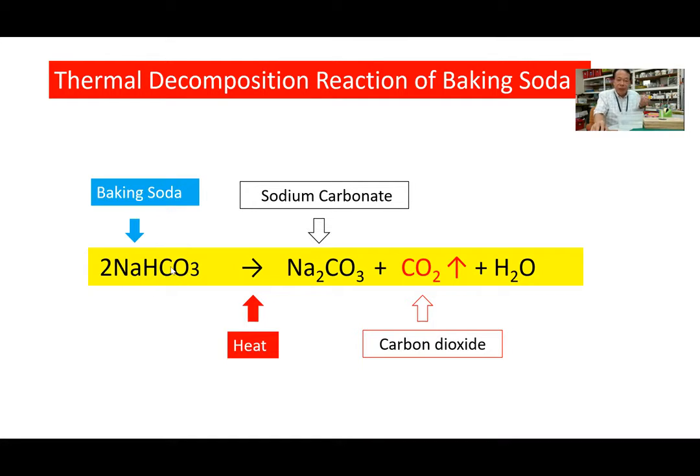Then if we heat this baking soda, it produces sodium carbonate. Then it produces carbon dioxide. This is a very important gas to expand the bread to be more soft. Okay. Then at the same time, it produces water. This is a very famous chemical reaction. We're challenging this one for today.